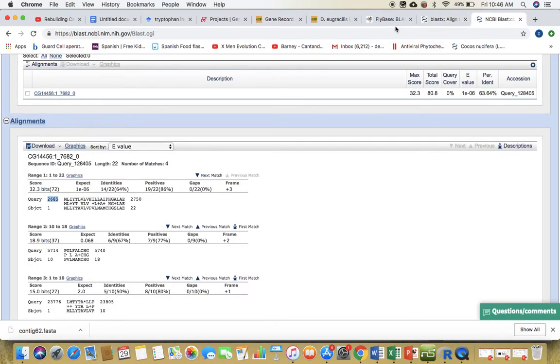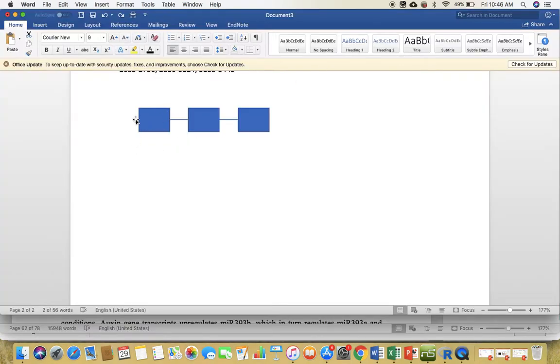So in order to annotate, we need a start site at this end here, and we need a stop site at this end here. Everything in between will be an acceptor or donor site, because remember the goal is to splice our introns out. So we could only have our exons, so we could see where the CDS, or the coding sequence, for our exons coming together, right? So we want to splice these introns out and splice our exons together. So we need a start site here.